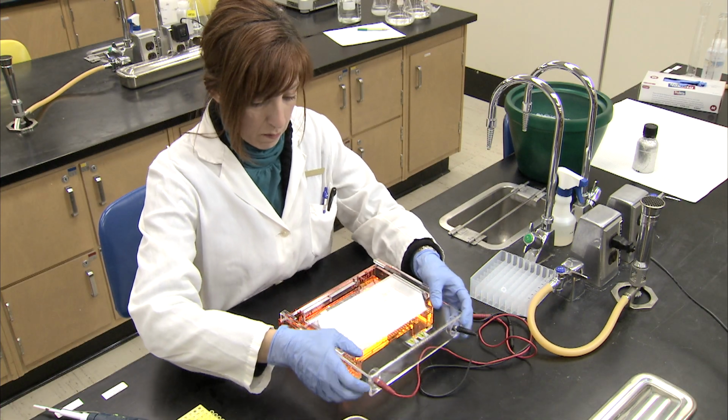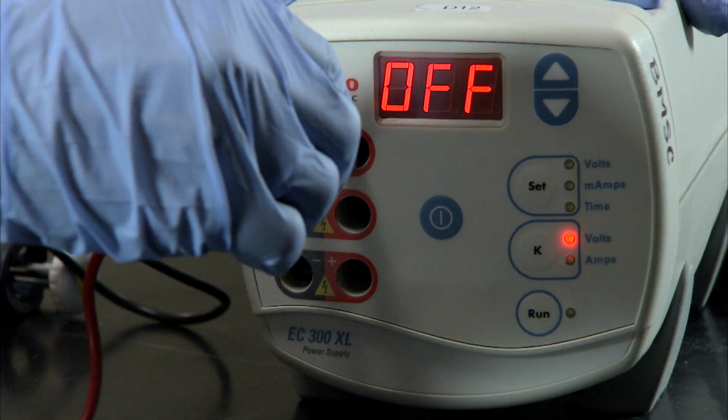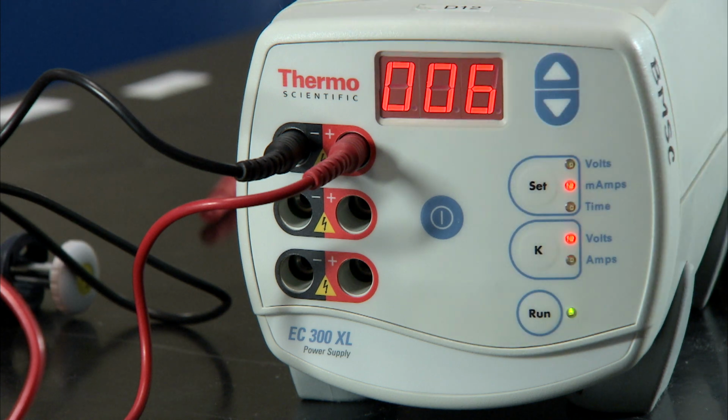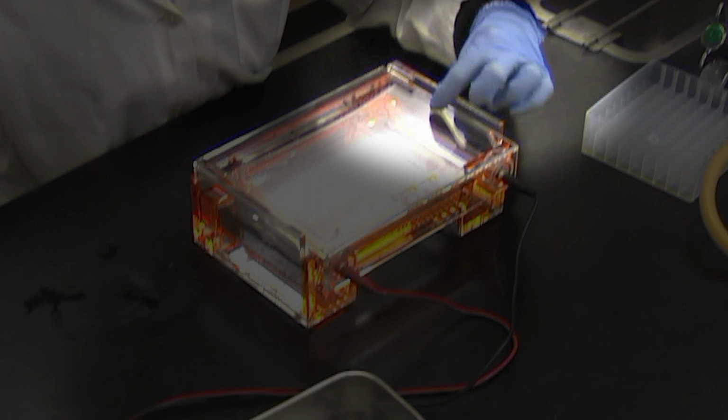Once all samples are loaded, the lid is attached and the electrodes are connected properly to the power supply. The voltage and time may now be set to initiate the process of electrophoresis. To make sure that everything is connected properly, look for bubbles forming on the electrode wires. Also, you may wish to watch long enough to ensure the sample is running in the right direction.